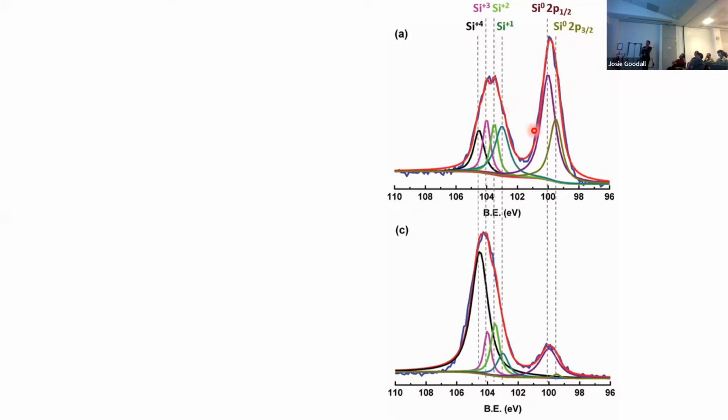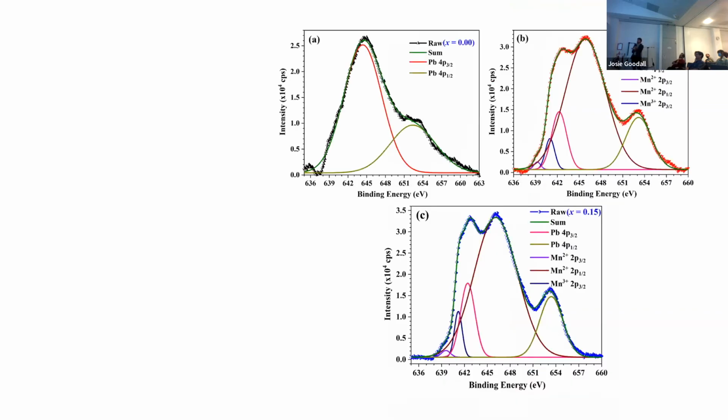They also haven't, I don't think, put them in the correct ratio, even though they reversed the order. There's a certain ratio of intensity that the spin orbit components should be, which I'll come to in a second, but I don't think that's been imposed yet. And it definitely hasn't been imposed down here, where we have a tiny little 2p3/2 and a whopping great 2p1/2. I'm pretty sure they just put some components in there. And we also have a throwback to some earlier problems here, with vastly different full width half maximum for these peaks.